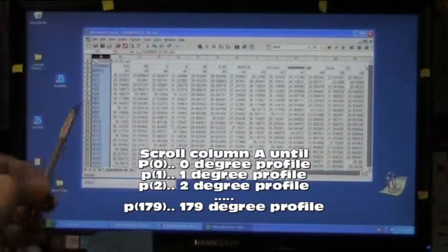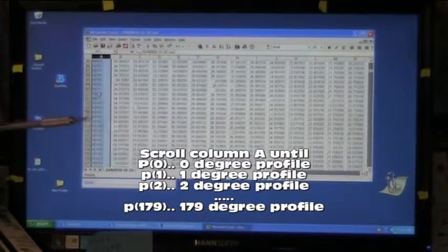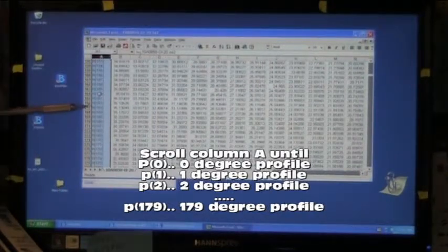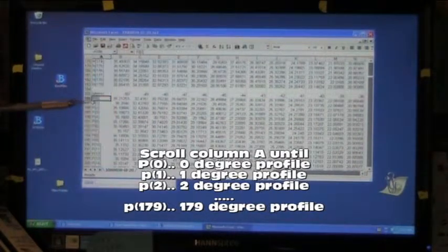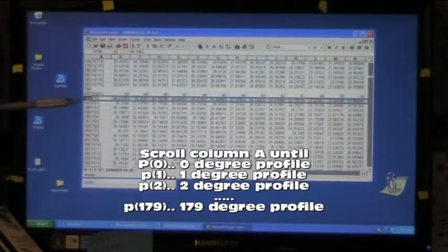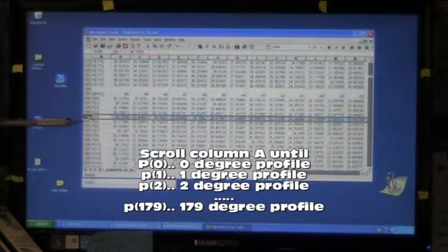Scroll down the A column to the P for profile rows, then select all the numbers in the row for profile at 7 degrees.